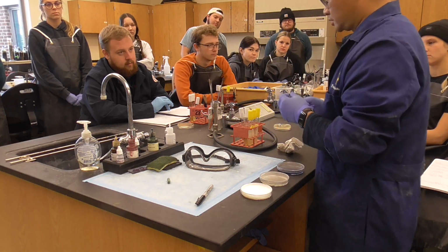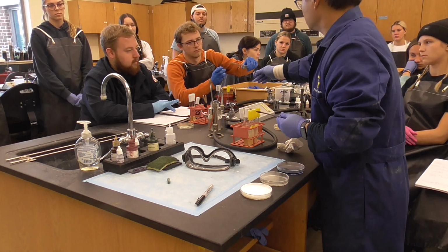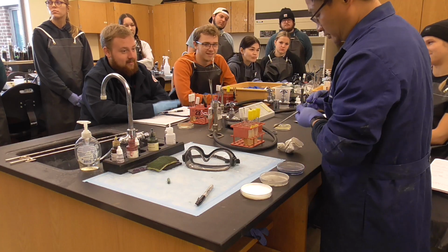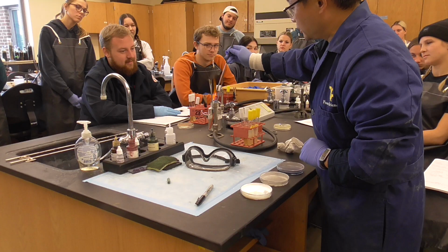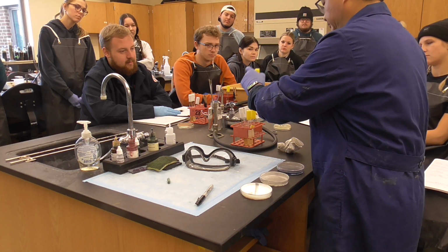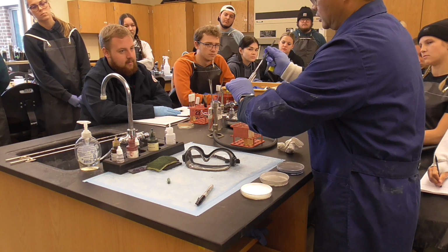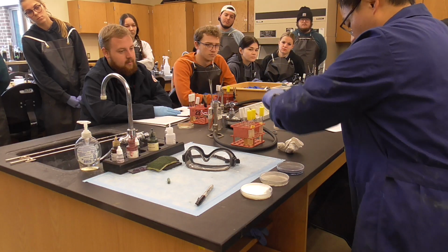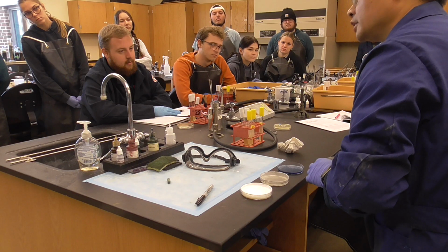Then what you do, this time you still use the loop. Okay, hope it works. Okay, not too bad. I just gave you one example. Flame the loop, cool it down, pick up bacteria, and put it on the plate.